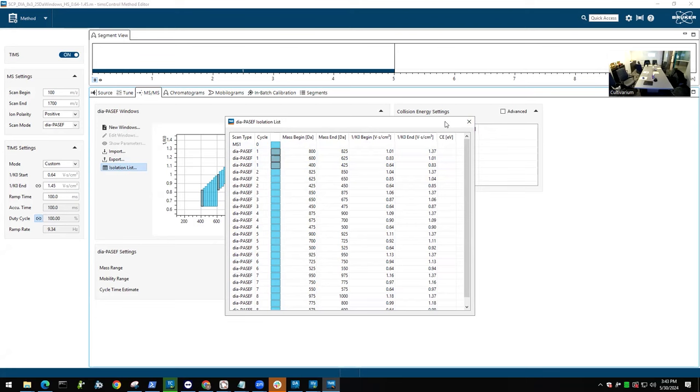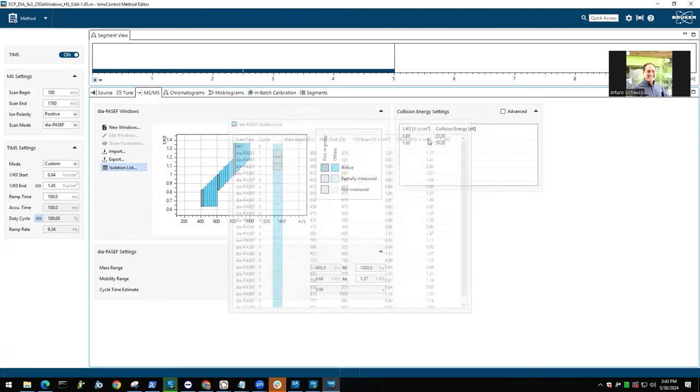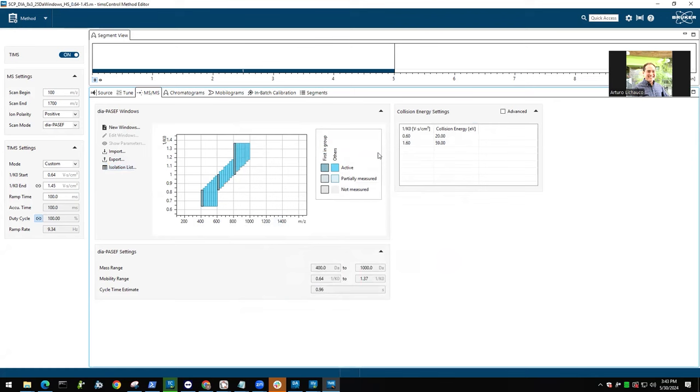Or what else you could do is there's this tool, py_diAID, by the Mann group, basically. You could use that as well to calculate the variable window placement across your ion mobility and m/z range.